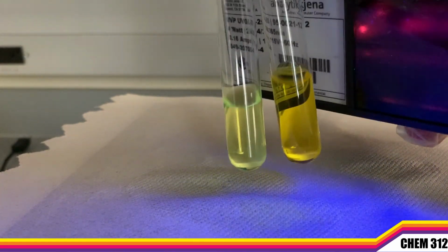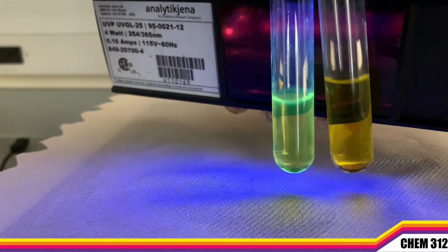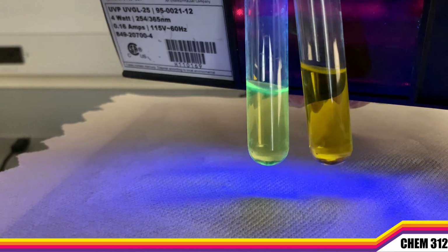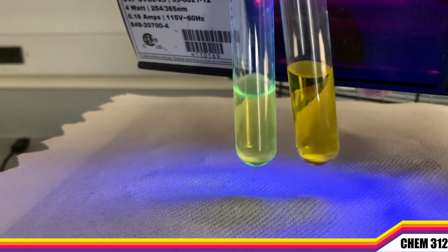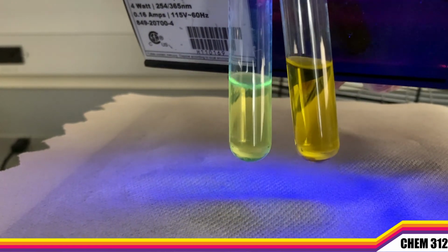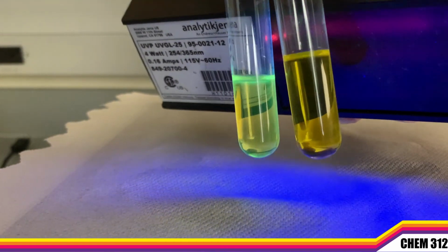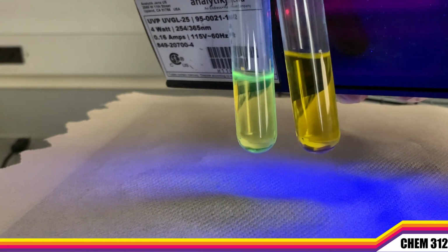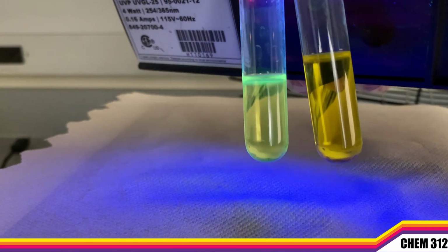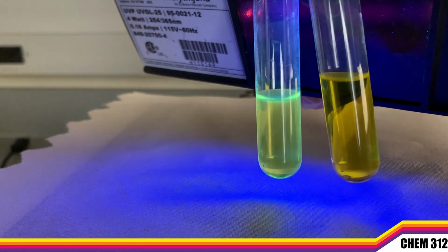Right, when we shine this ultraviolet light on these samples, we can see that one is glowing green and one remains that yellow color. That green glow is because of a complexation with aluminum. So I added some aluminum to this left-hand test tube, and that's what causes it to glow a little bit more of that greenish color, whereas the imine itself doesn't really glow, right? It remains that same yellowish color. So this is the process of fluorescence. It's absorbing light in the ultraviolet region, and it's emitting this green light in the visible region.